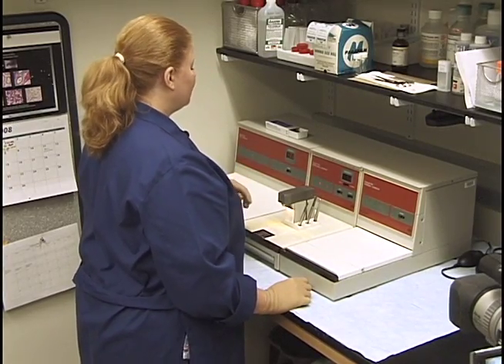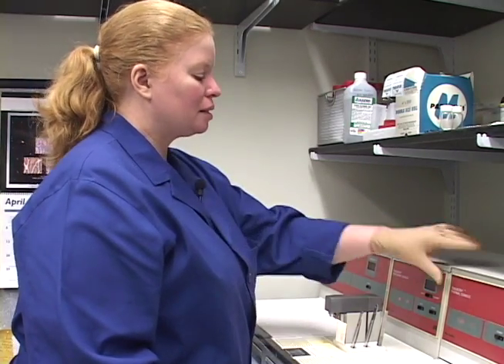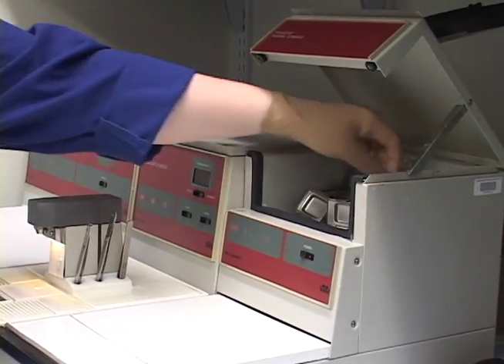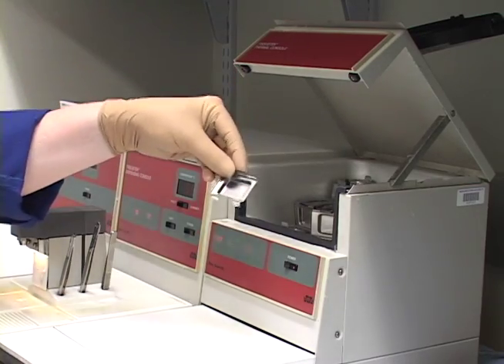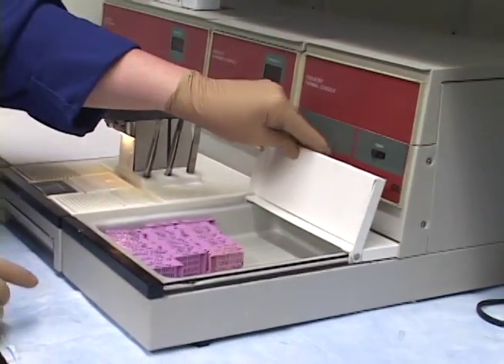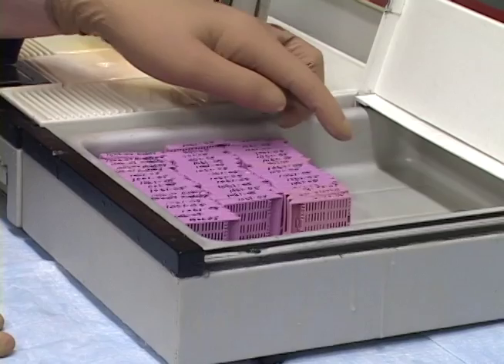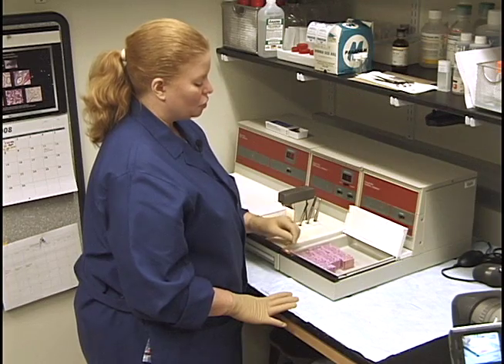This is the Tissue Tech Embedding Center. It has three consoles. This is the thermal console and it holds the boats or embedding molds. We have three sizes: a smaller, a medium, and a larger one. Inside is a warm chamber where we keep the cassettes warm after taking tissue off the processor. Some histology technicians keep this full of paraffin, but I keep it wiped out and dry.